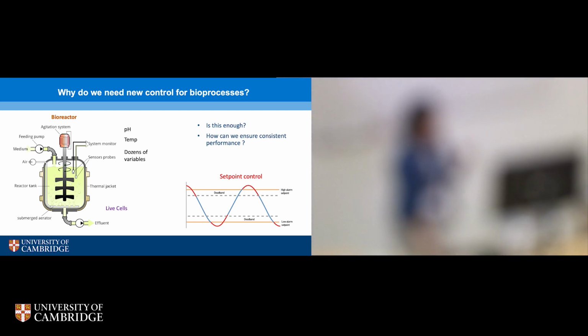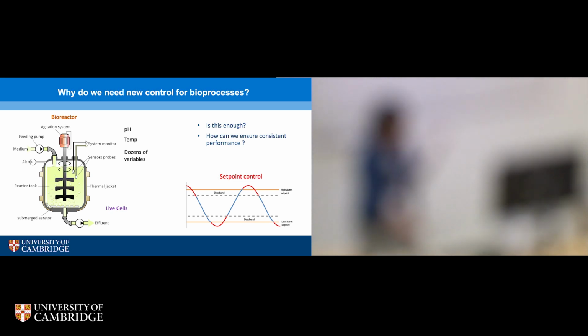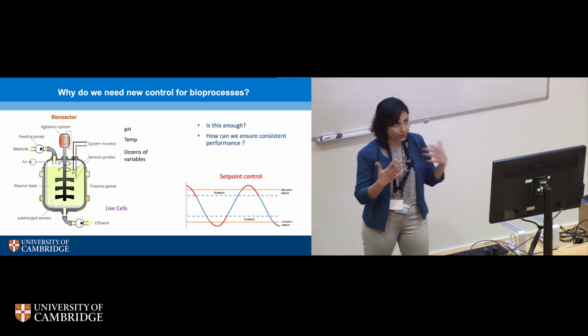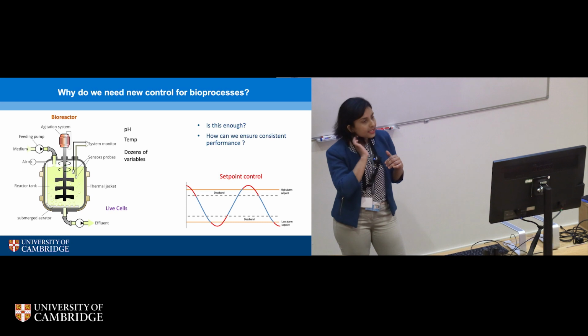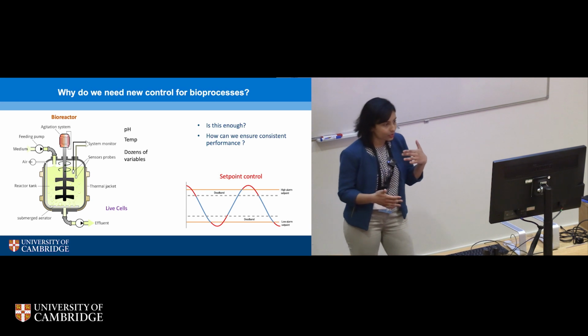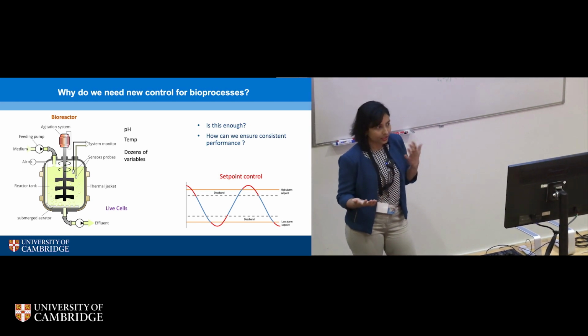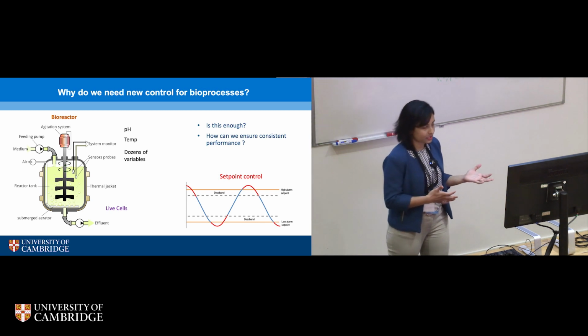Because if you know what values certain variables like, you can do a set point control, which basically means you can use a PI or PID controller, and say that this is the range we want the value to be within. If it goes above or below that range, it takes a control action. But what happens when we don't know what value they like? Then it becomes really complicated.